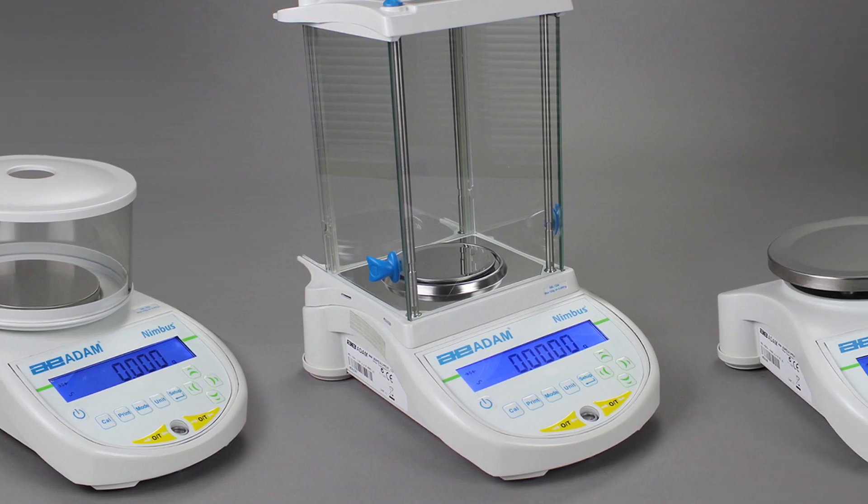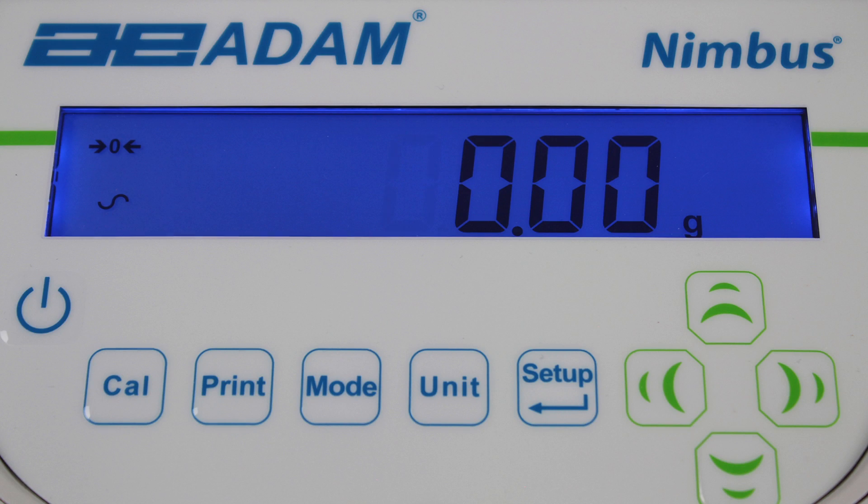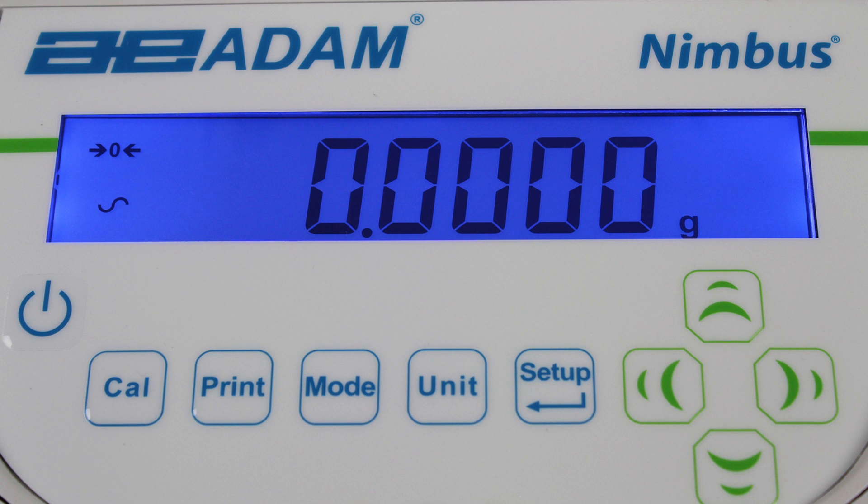With a range of analytical models and precision top loaders, the Nimbus delivers results from one-tenth of a milligram to one-tenth of a gram, with capacities up to 22 kilograms.